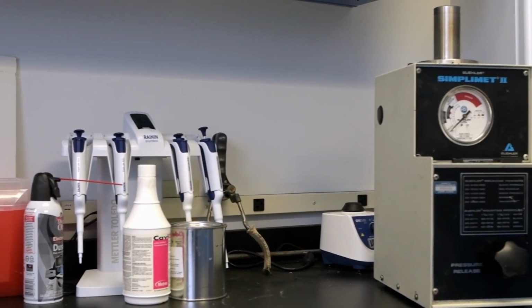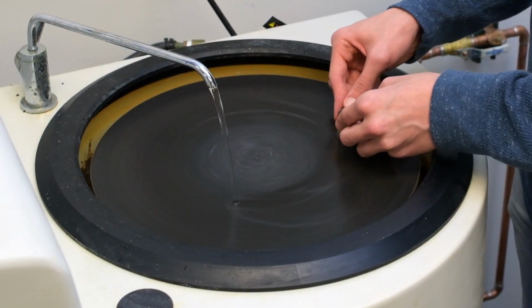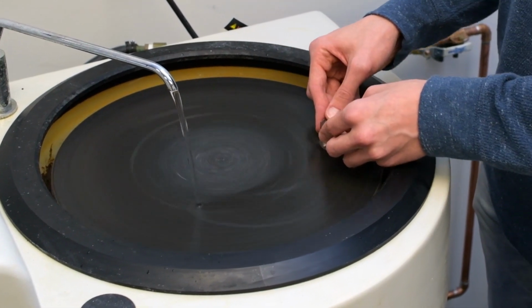Hello, I'm Mark Heineman. I've been with ESI for 22 years, and I'm a metallurgical engineer and use the equipment in this lab to examine the microstructures of various different metals. We mount the samples like this in this mounting press here, and we grind and polish to get a very smooth and flat surface that allows us to evaluate the microstructure. We examine it both in the as-polish condition and after etching with different chemicals to provide contrast between the different microstructures in the metal.